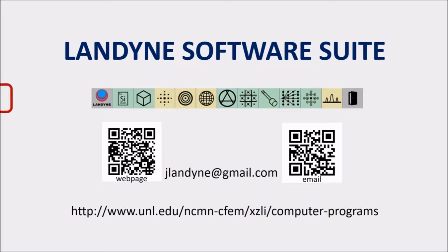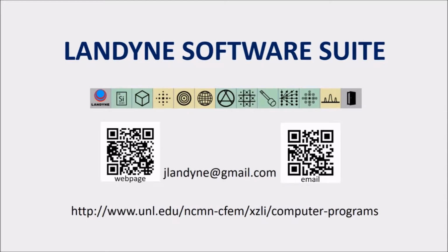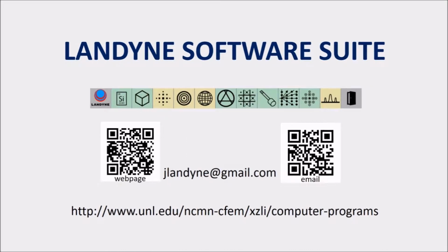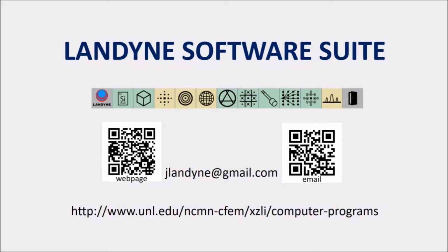In this tutorial video, I will introduce SAED3. The current version is 3F. This is a main component in the Landyne software suite for electron diffraction simulation and crystallography analysis. You may download the software suite from the website on the screen.